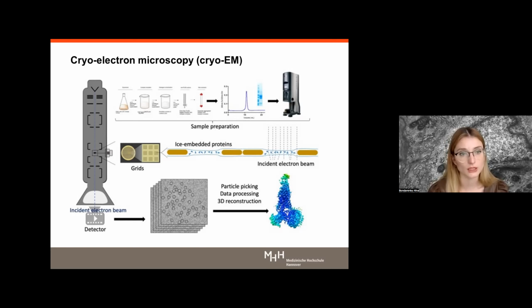However, during freezing, the proteins will have multiple different orientations, each leading to images of the protein at different angles. As a result, software can combine all these images and perform a 3D reconstruction of the protein in the area of our interest.